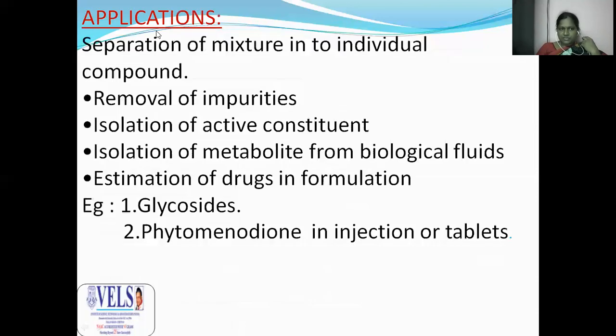The last heading is application. The chromatography technique is mainly used to separate substances from your solution, and also for removal of impurities, isolation of active constituents, isolation of metabolites from biological fluids, and estimation of drugs. Column chromatography is also used for quantitative analysis, for example of glycosides, phytomenadione injections, tablets, and so on.